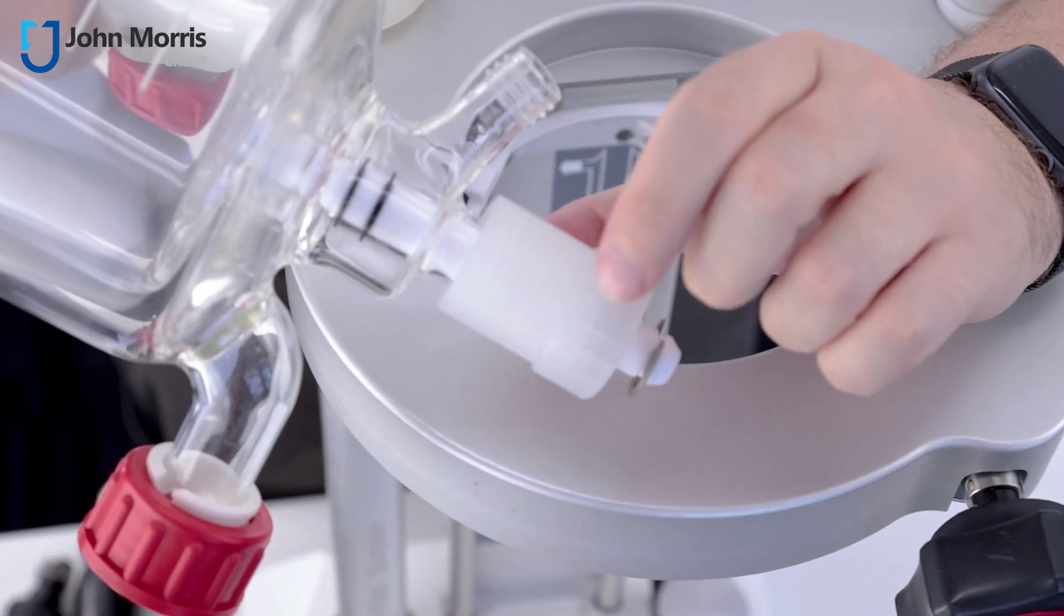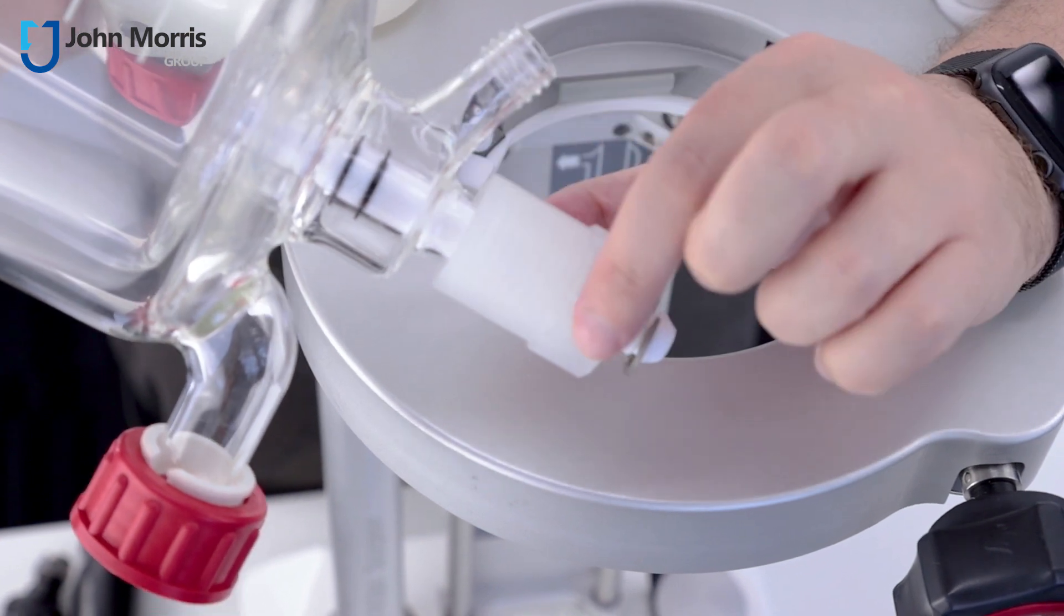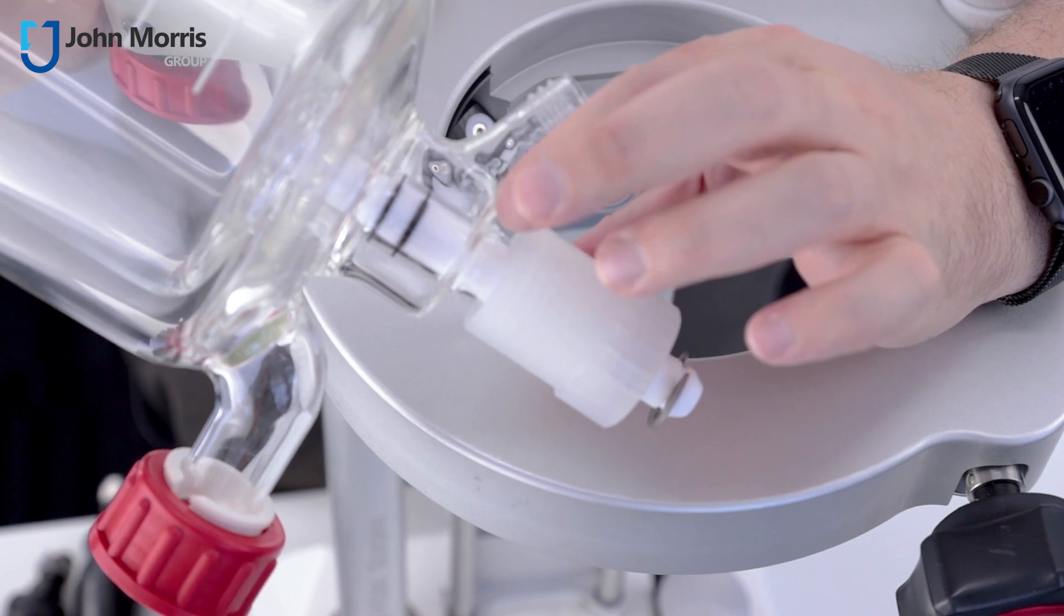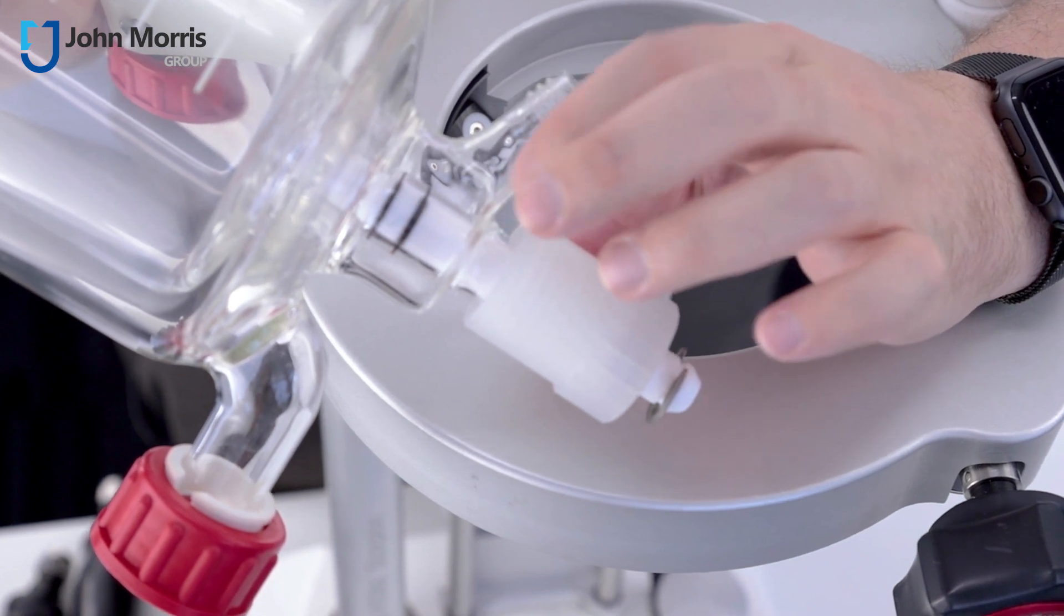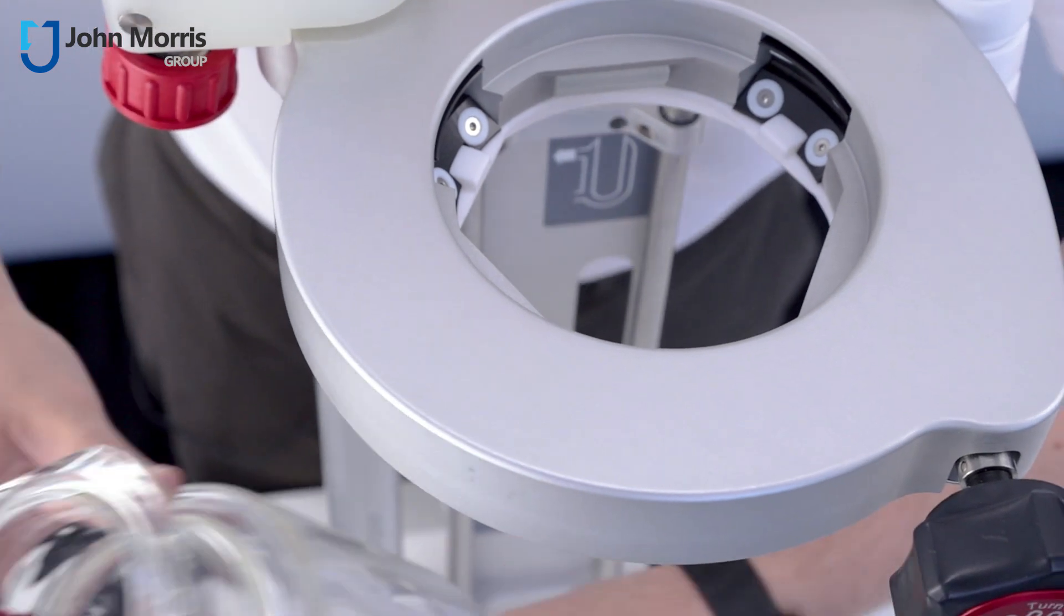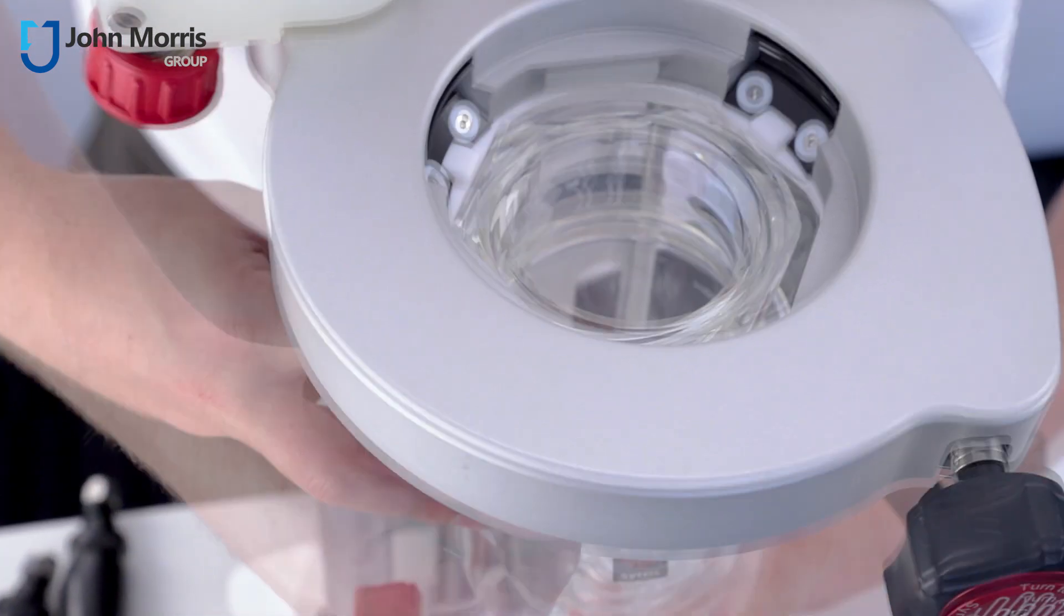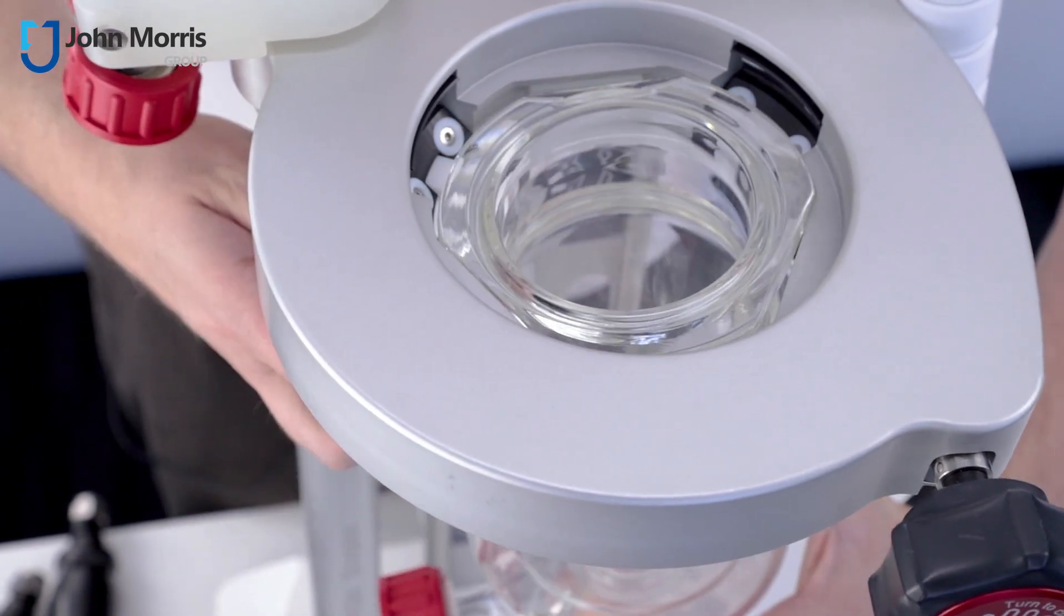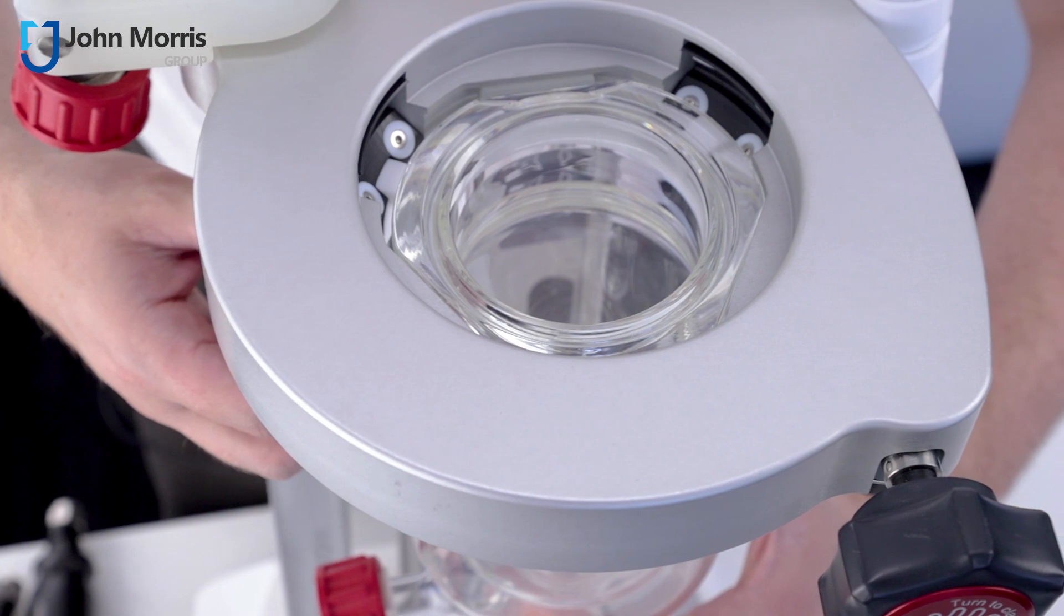There's a number of innovations in the Cirrus glassware including this spring-loaded drain valve and the nice way that it curves down here so that you get almost all of the product out simply by opening the valve. Let's load it and then rotate and now it's held in position and can't fall.